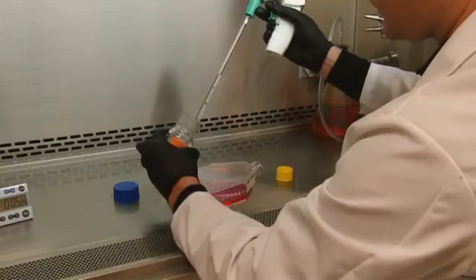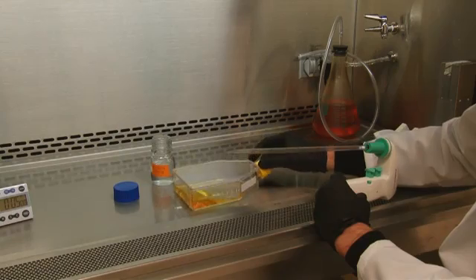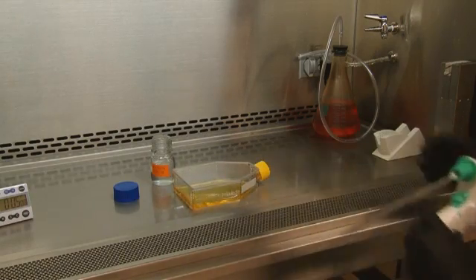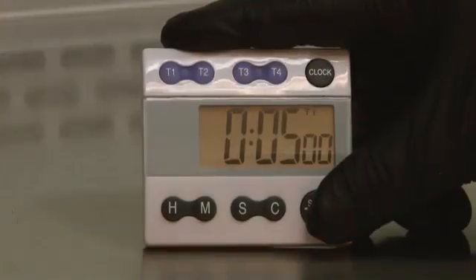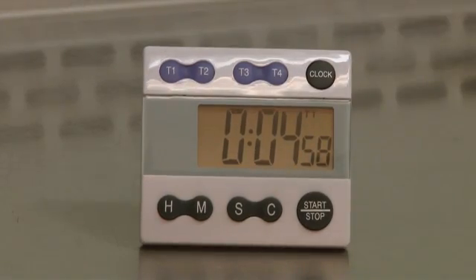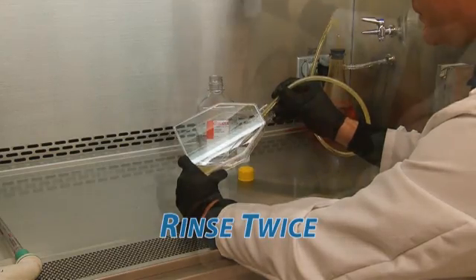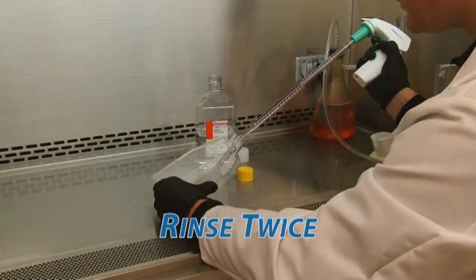To quench the cross-linking reaction, we next add enough glycine to the flask to reach a concentration of 125 millimolar or 1x if you have a 10x solution. Incubate for 5 minutes at room temperature. Remove all medium and rinse twice with ice-cold PBS.